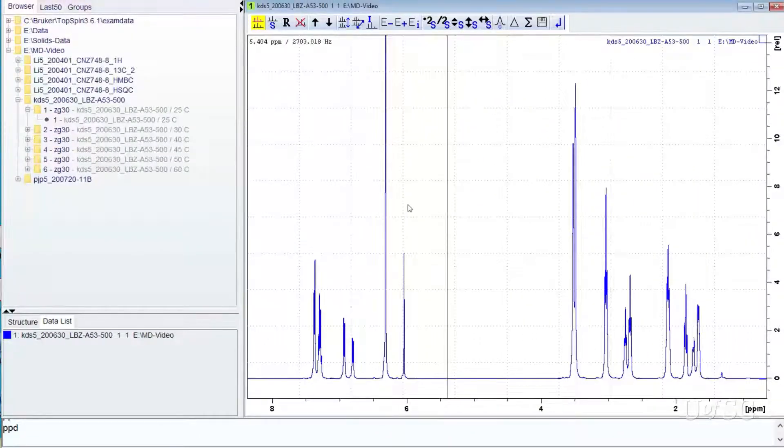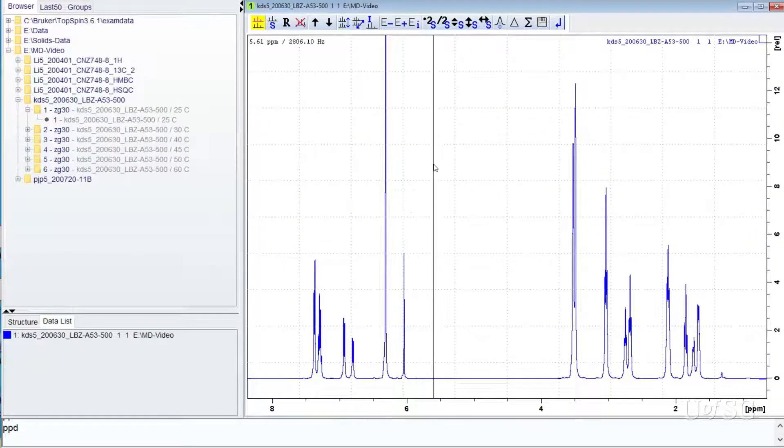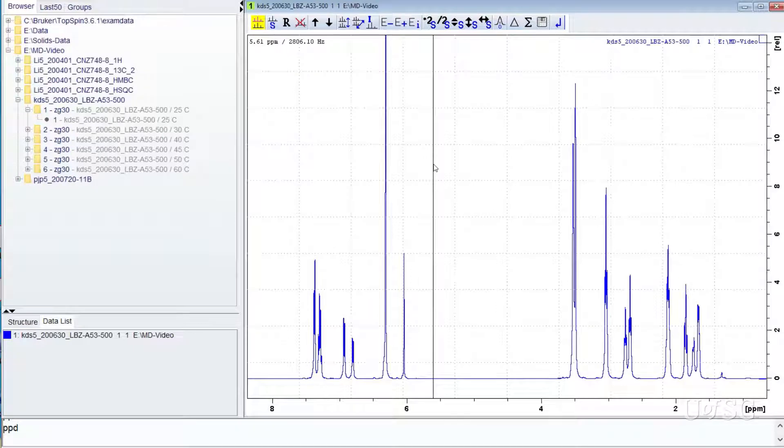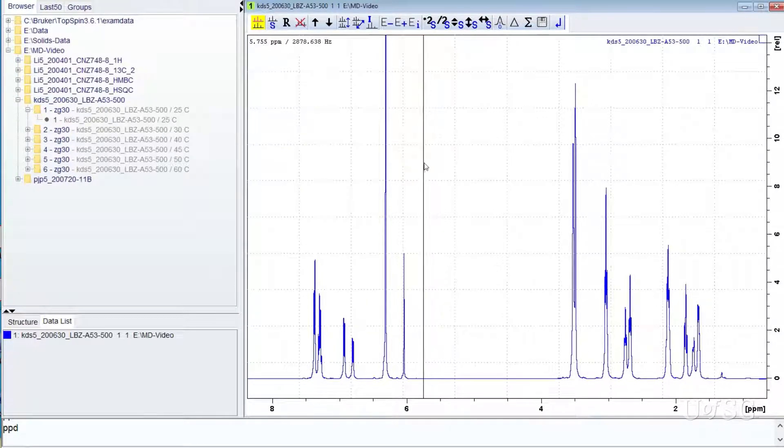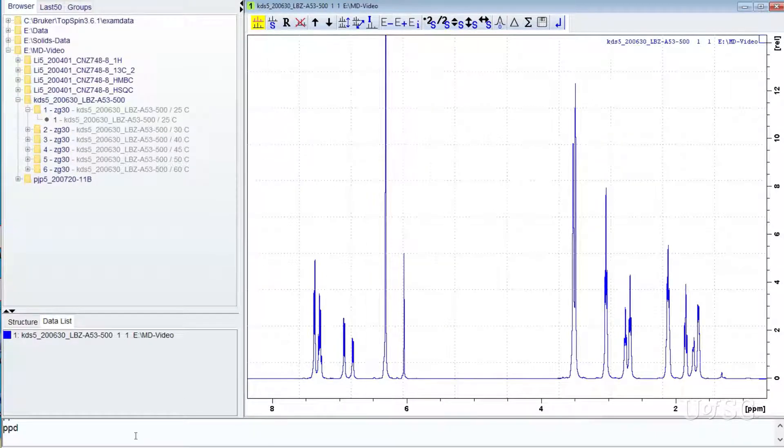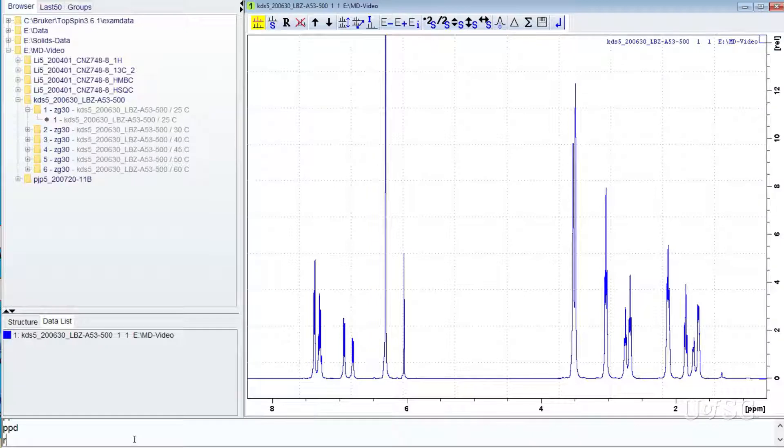First, we have to add another spectrum into the multi-display mode window. You could do this by either using the RE command or by dragging the new spectrum from the browser panel.